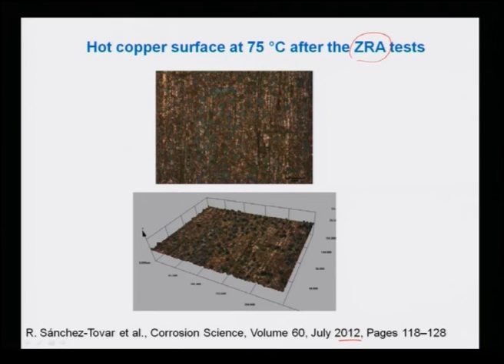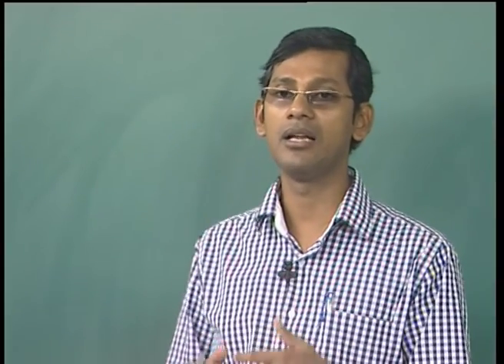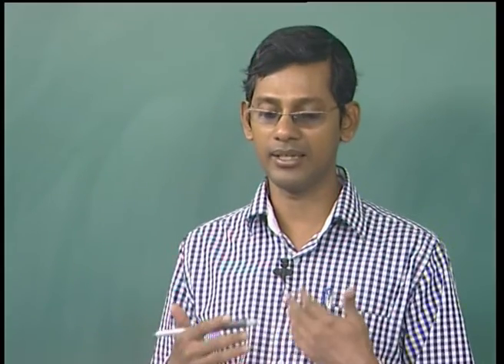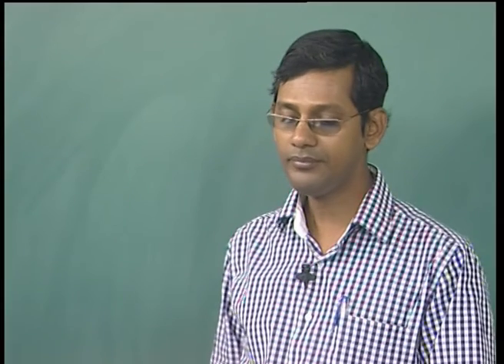So the clarity, and the micron distance is 40, 56. And this is a large scale, and the resolution is much better than the normal optical microscopic image. So one can actually probe this kind of effects, and as I said in the lecture, new applications are coming into the picture as people started learning these techniques more and more, so one can use it more and more.